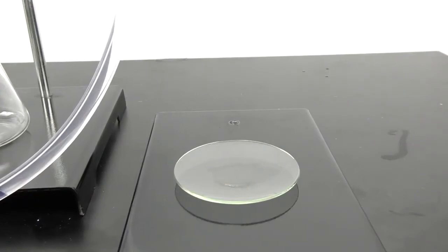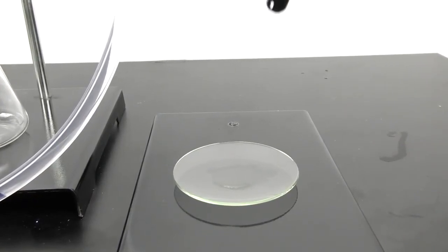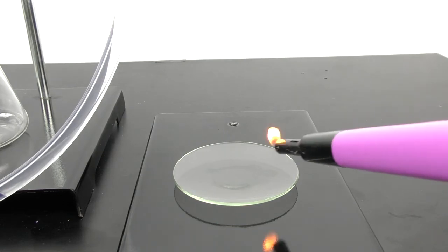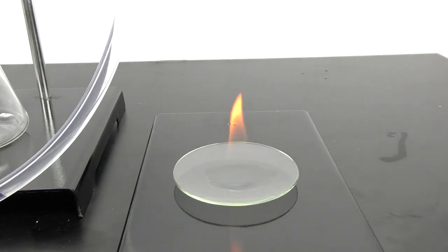Here just to show you what came out of that I poured a little bit of the liquid distillate in this watch glass. It is definitely alcohol and not water.